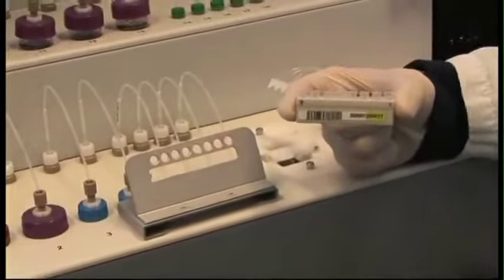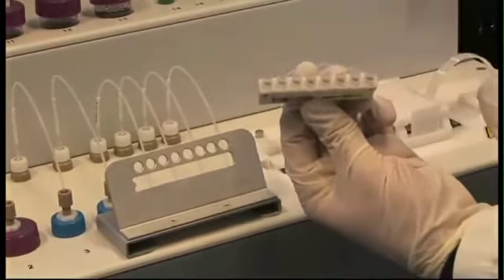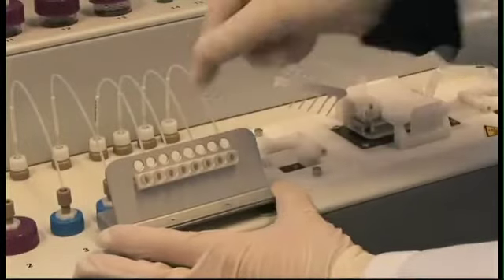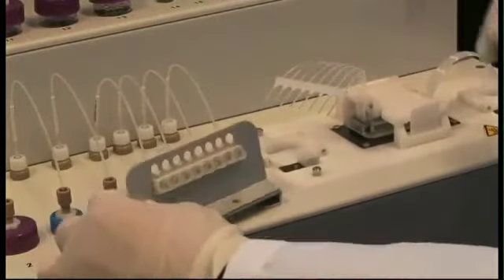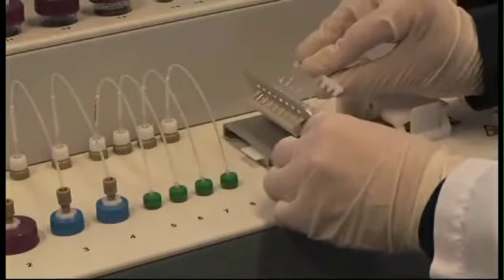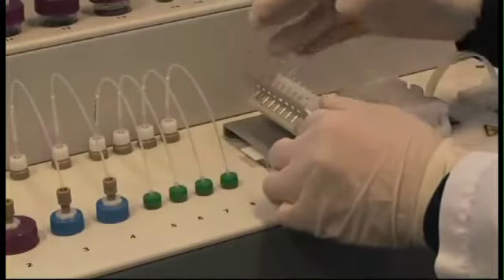At the Broad, we've made some improvements to the cluster station. One of our inventions is a lock and key fit holder for our hybridization library strip tube. This key is unidirectional, so the strip tube holder can only be placed one way. This ensures that libraries flow through the correct lanes.